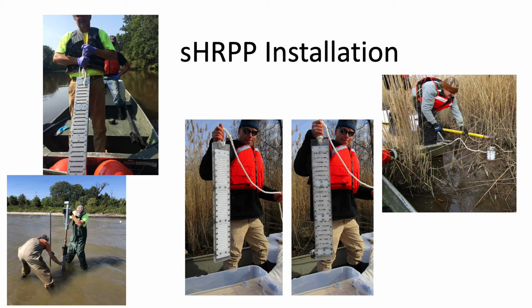If required, they can also be inserted using more mechanical devices such as a vibrocore geoprobe. But in this presentation, we're primarily going to focus on the insertion by hand. You can also see that it's possible to deploy these from a boat or by wading in from shore, and they can be deployed in open water, in marshes, in bays, estuaries, numerous applications of almost any type of sediment.